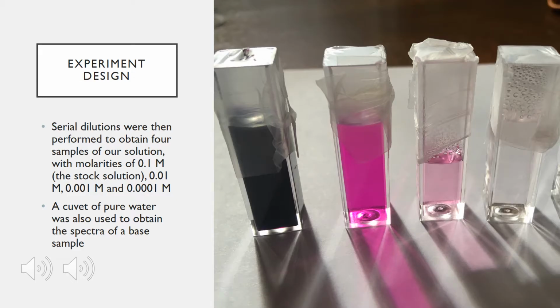To create our specific samples, we went through serial dilutions. These dilutions were performed to obtain 4 samples, with our initial molarity of 0.1, and then 3 others that came to 0.01 molar, 0.001 molar, and 0.0001 molar. Serial dilutions are performed by filling test tubes with, in our case, 9 milliliters of pure water. Then using a pipette, 1 milliliter of the 0.1 molar stock solution is added to the first test tube and mixed thoroughly. That creates a 1 to 10 dilution ratio.